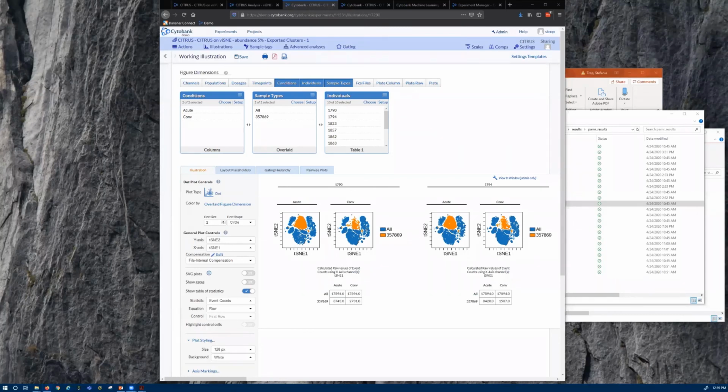Also, for example, with single cell RNA-seq data, you usually have a lot of channels or features, but only a limited number of cell events. You probably have less than 10,000 events, maybe 8,000 analysis cells, but probably 500 or 600 genes or most variable genes that you want to look at. In these cases, yes, you can run Citrus with that kind of single cell RNA-seq data.